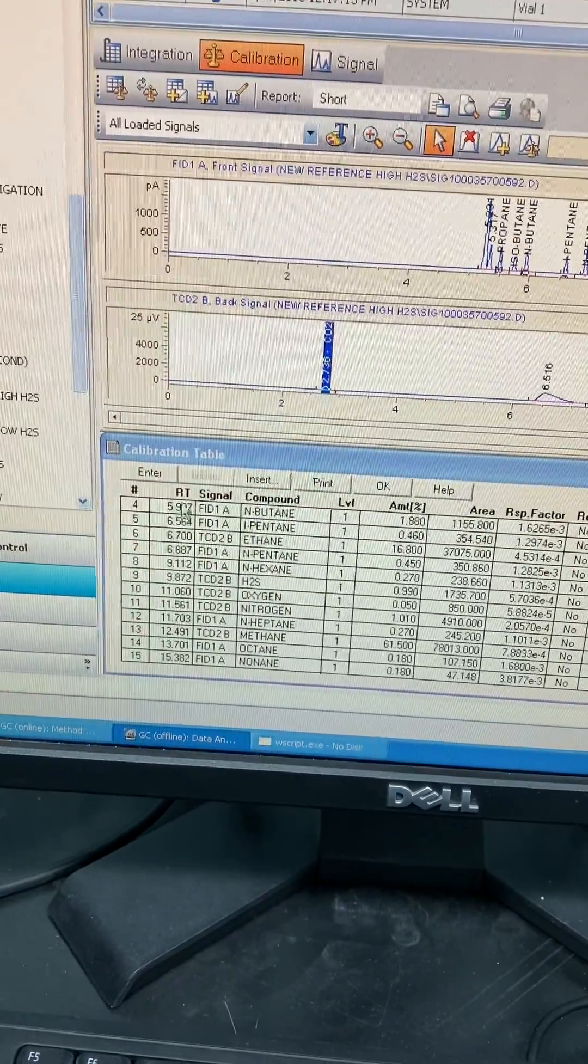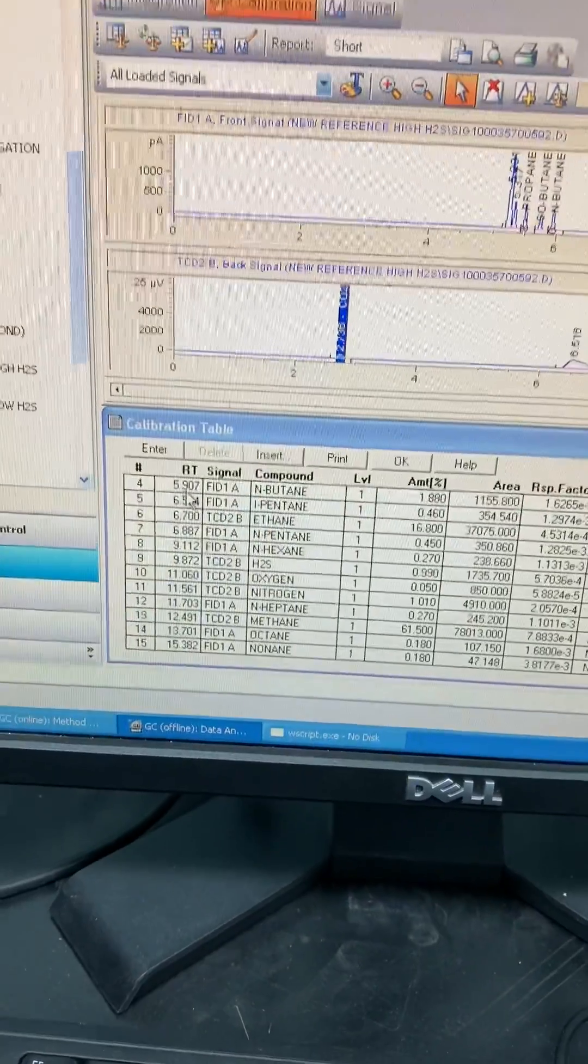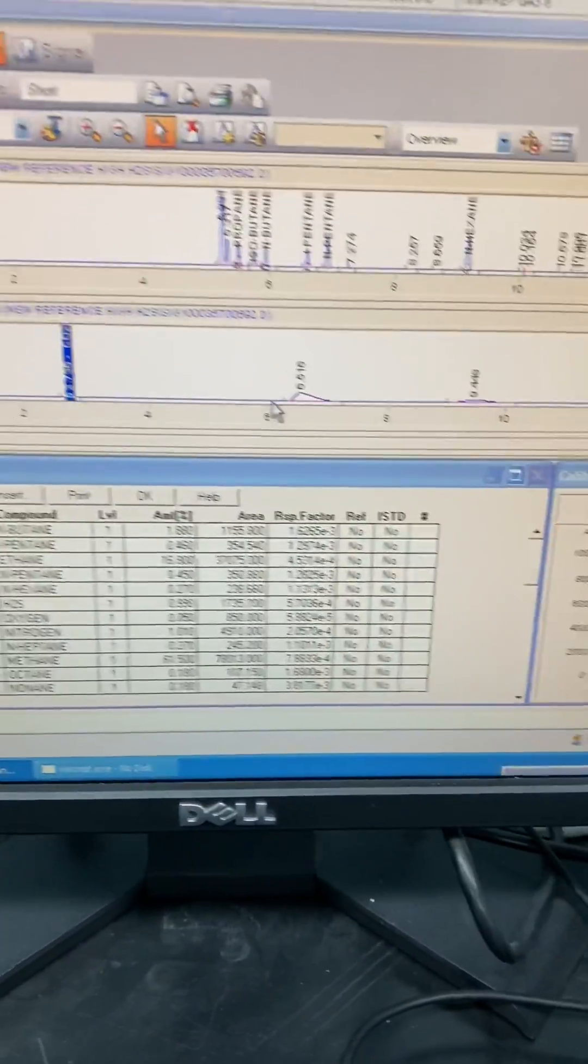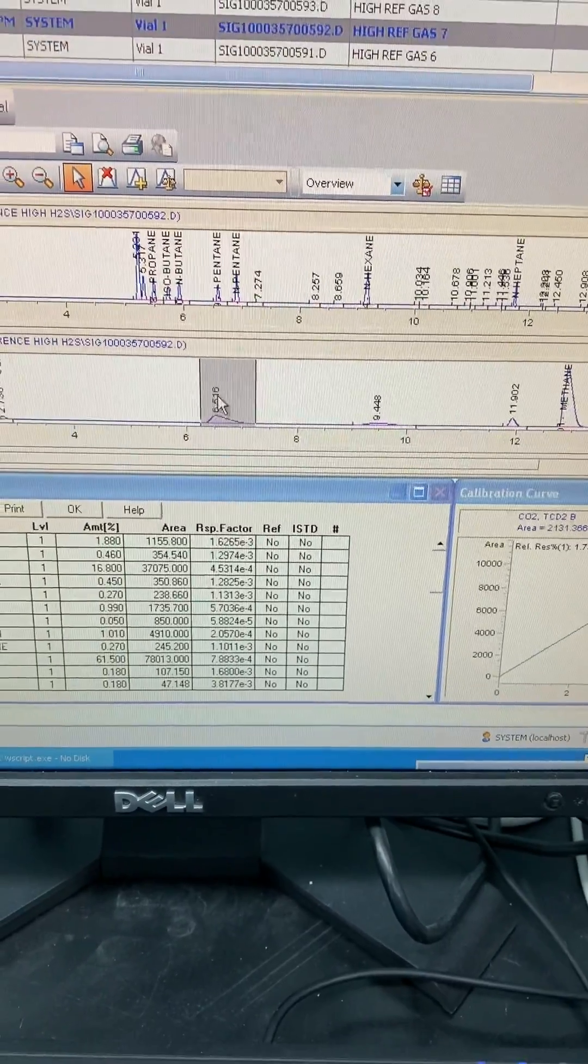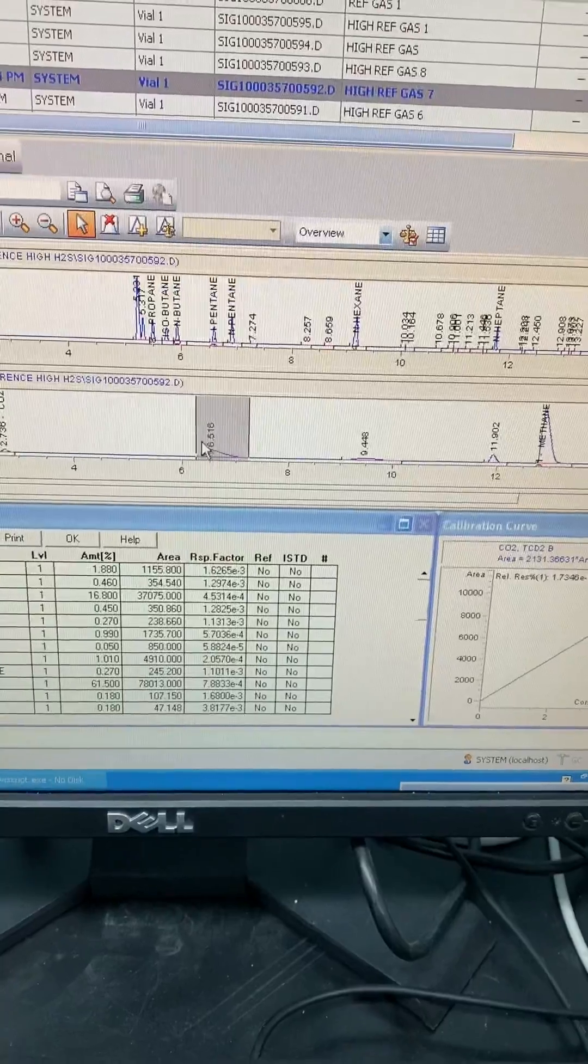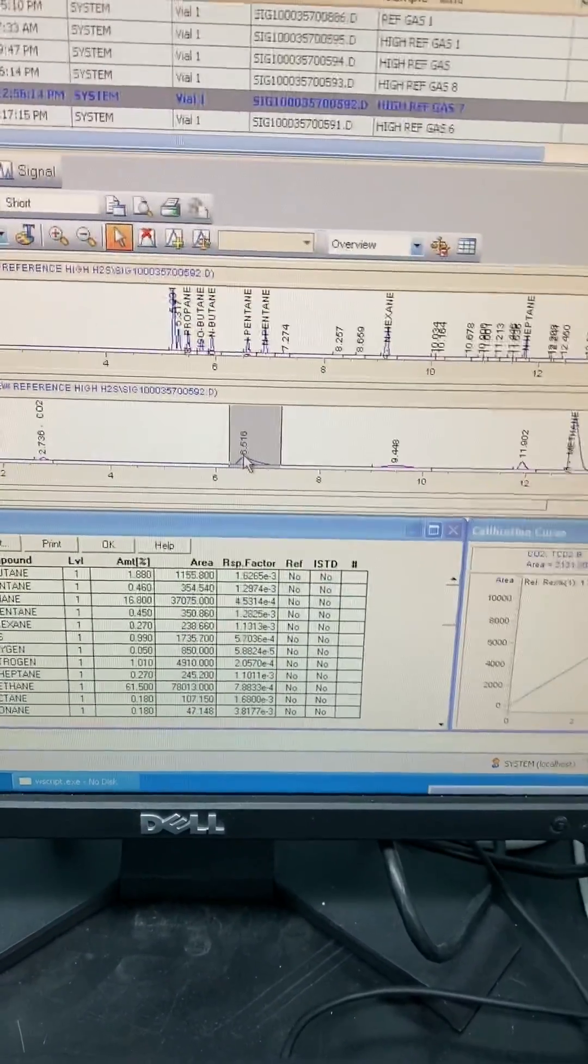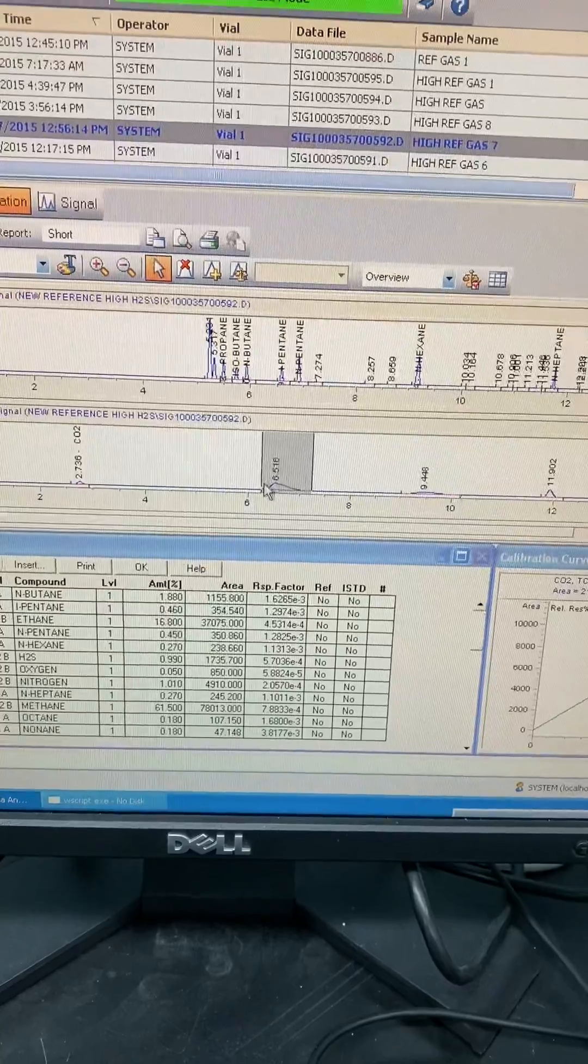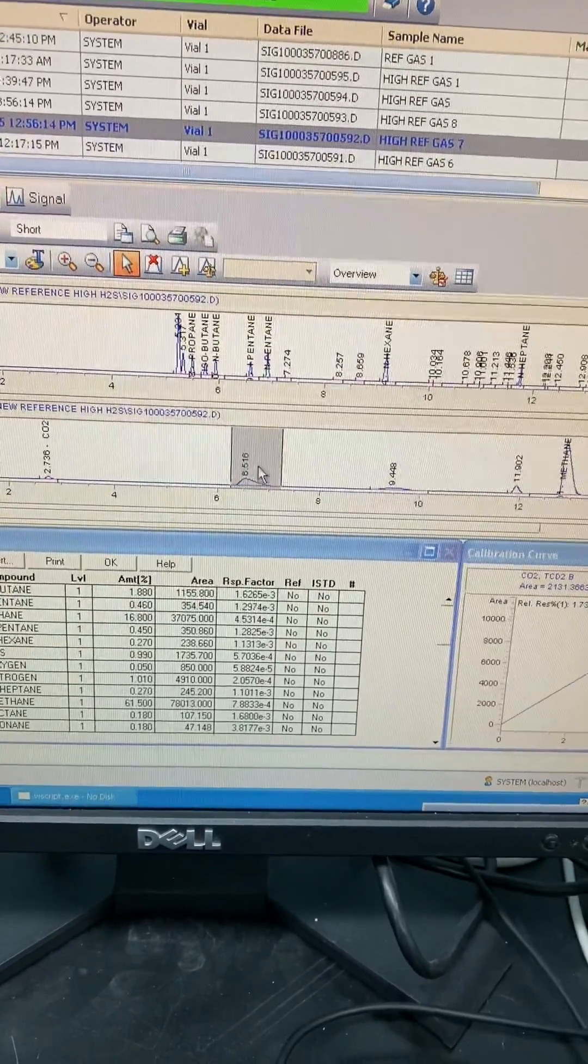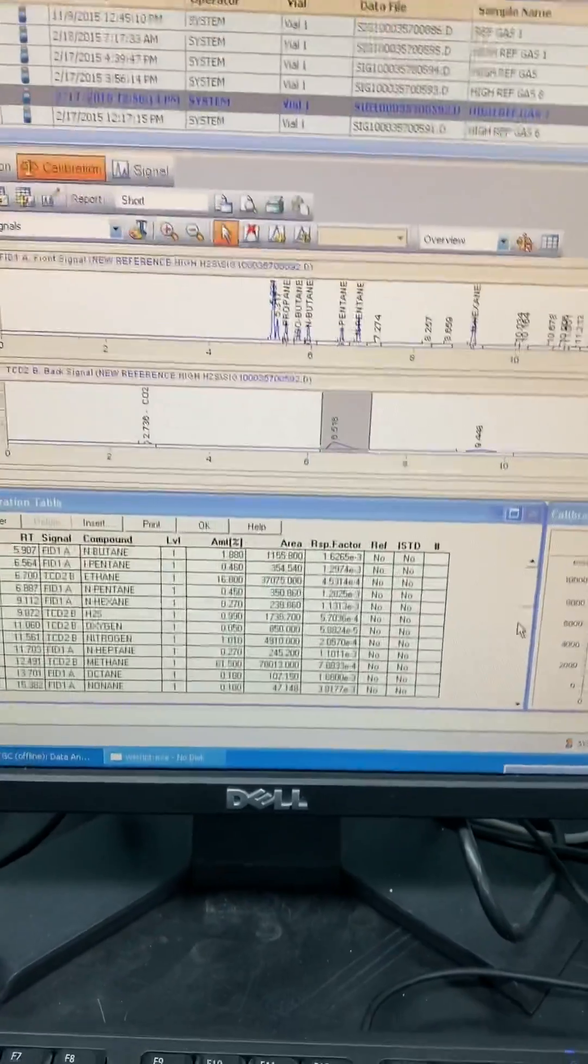The retention time for the normal butane peak is at 5.9. I can see here, this peak, it's not detected, already detected, but not named or quantified. So that means either there is a shifting in the peak, or from the beginning, or this method doesn't have any peak at that retention time.